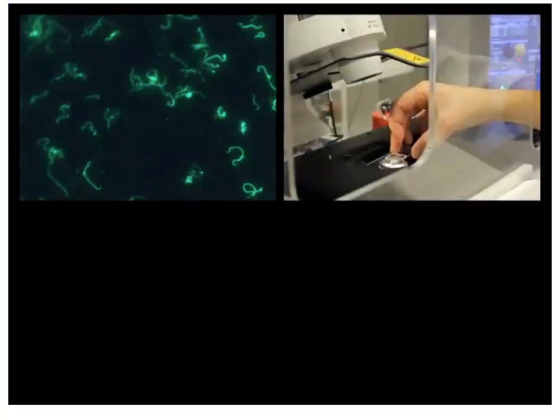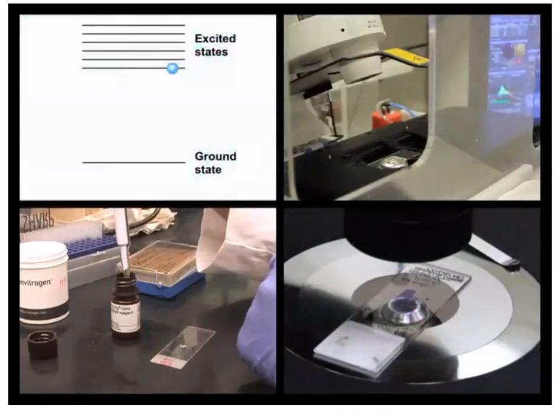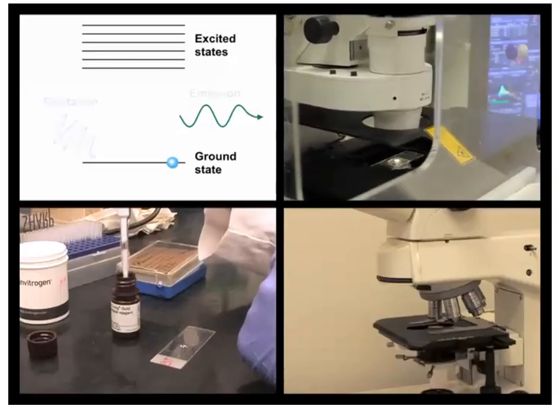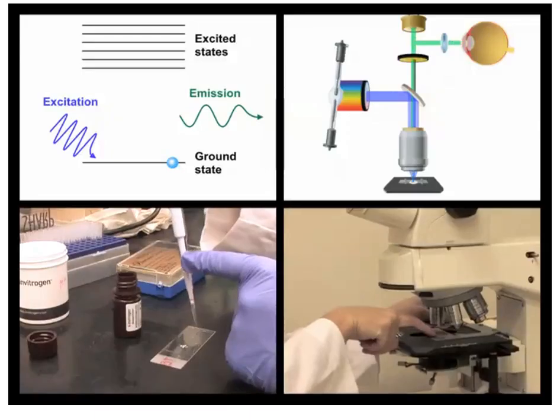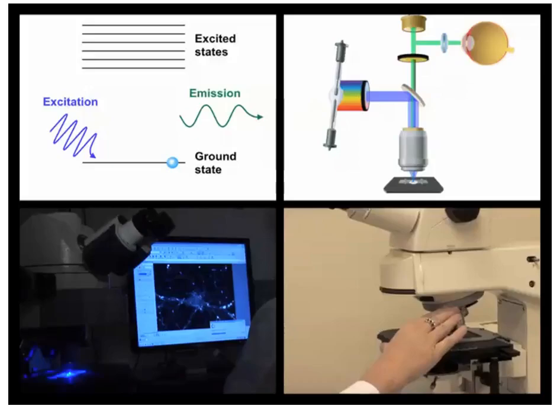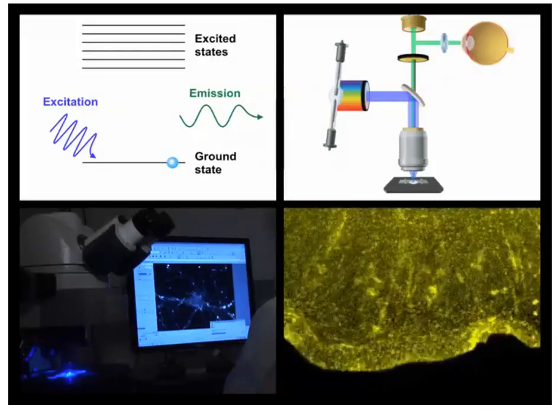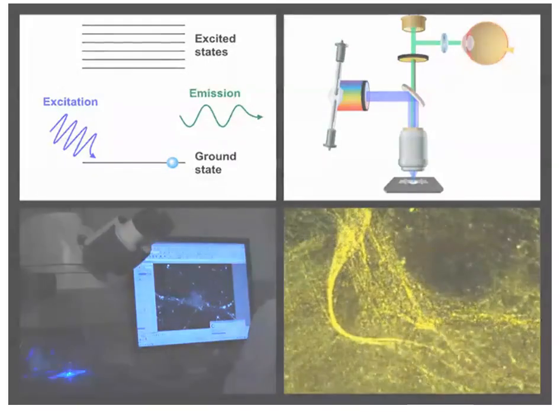You've just watched JoVE's introduction to fluorescence microscopy. In this video, we learned about the concept of fluorescence, how fluorescence microscopy differs from light microscopy, and how to take a fluorescence image through the scope. We also learned about some basic and advanced applications that use fluorescence.